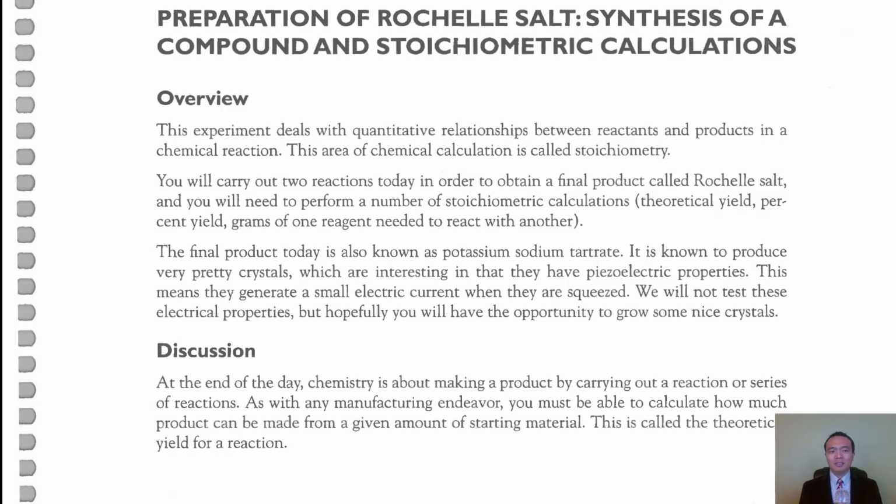Good day, everybody. In this week's experiment, we'll be working on the preparation of Rochelle salt. First, you'll watch the video and we'll show you how to synthesize Rochelle salt in 2 steps. In step 1, we show you the decomposition of sodium bicarbonate to generate sodium carbonate as the product.